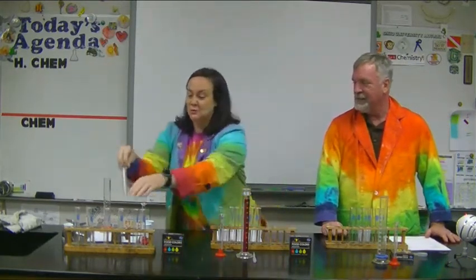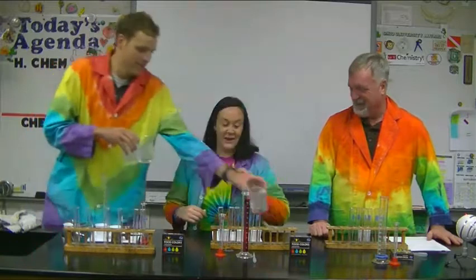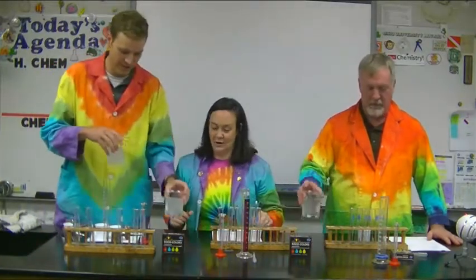Little does he know he's not going to win this one. The trick is to have all of your test tubes identical. This one's a little thinner, so we will just... He's not winning this one. All right. We're ready, Mr. Pilcher. Hurry up. I'm sorry. Do we rush people who do you favors all the time? Apparently we do around here. Thank you. All right.